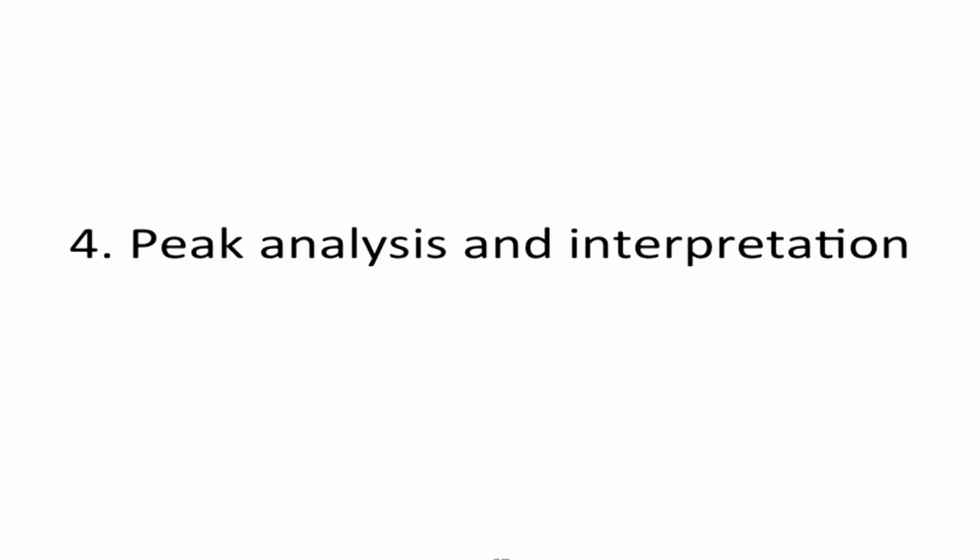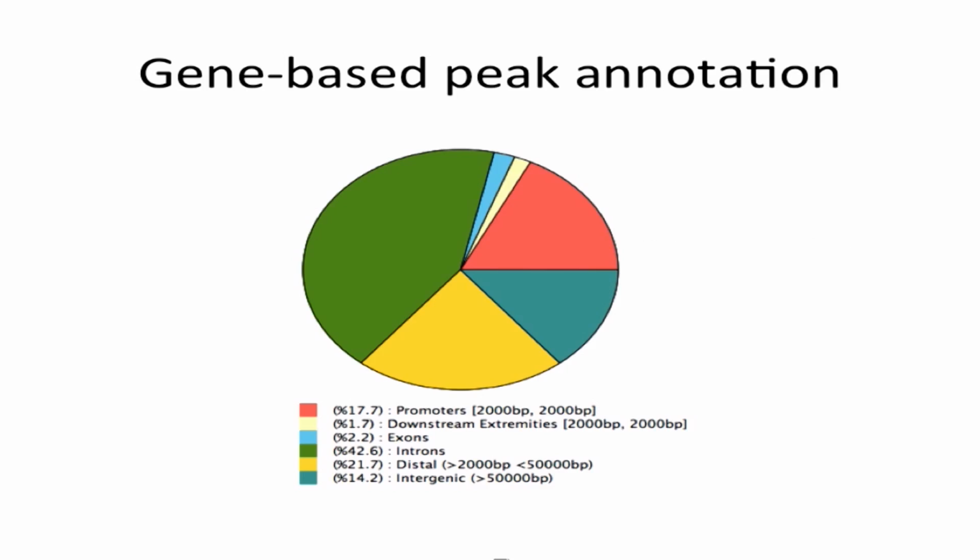Okay. So, peak analysis and interpretation: these are the set of operations that you want to do once you get peaks. I usually say getting peaks is, to me, actually the most boring part of the process. Peaks don't really tell you much. It's the analysis of these peaks that really helps you interpret your data. There are multiple things that you can do with your peaks.